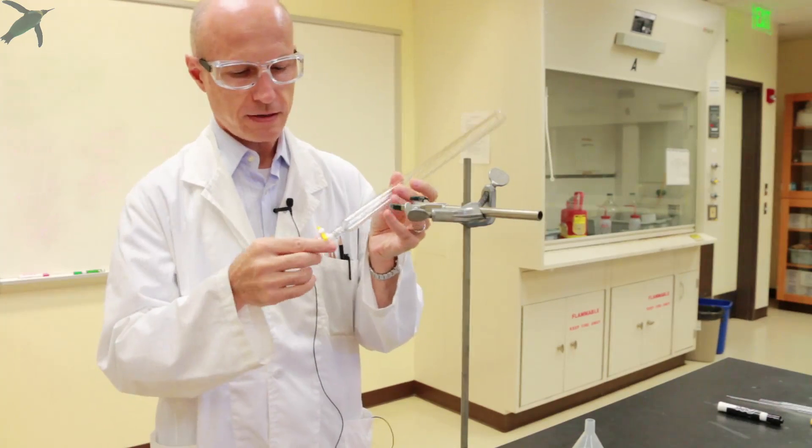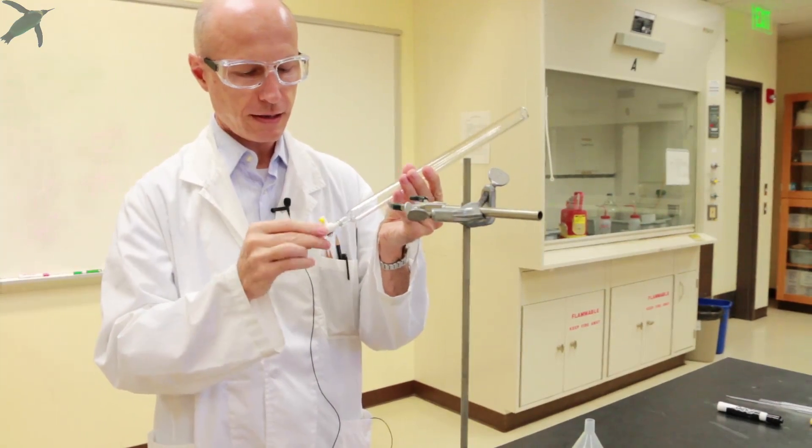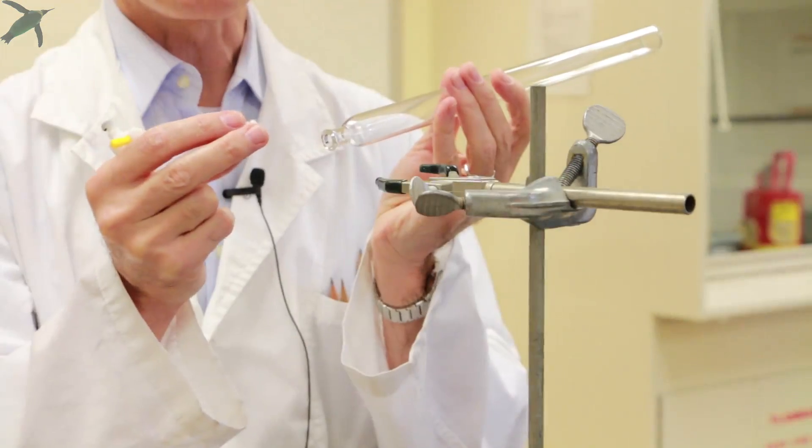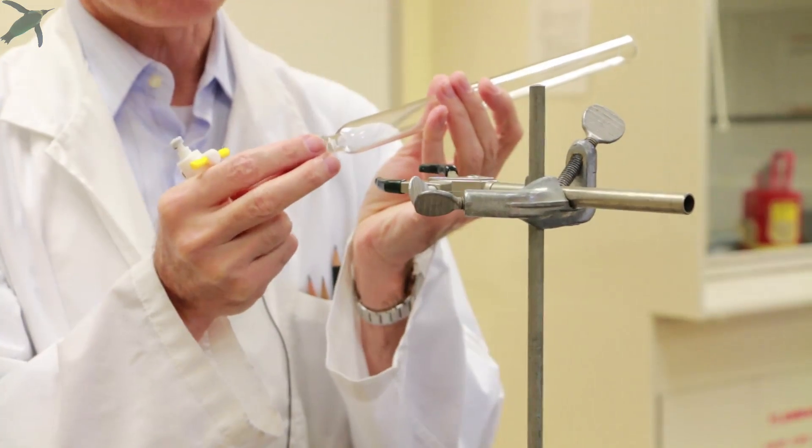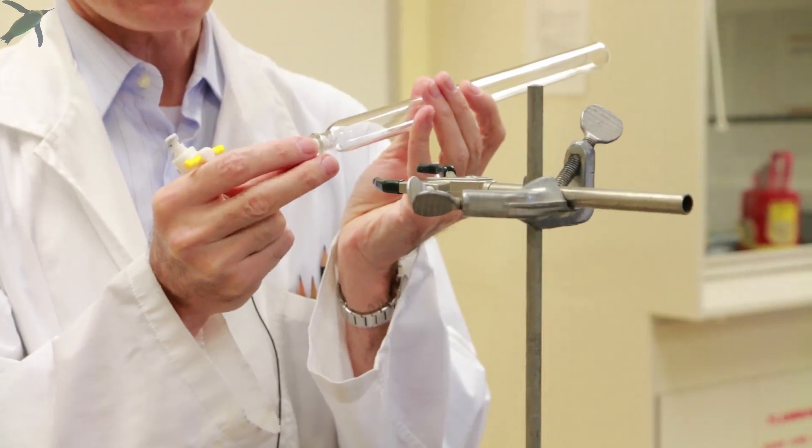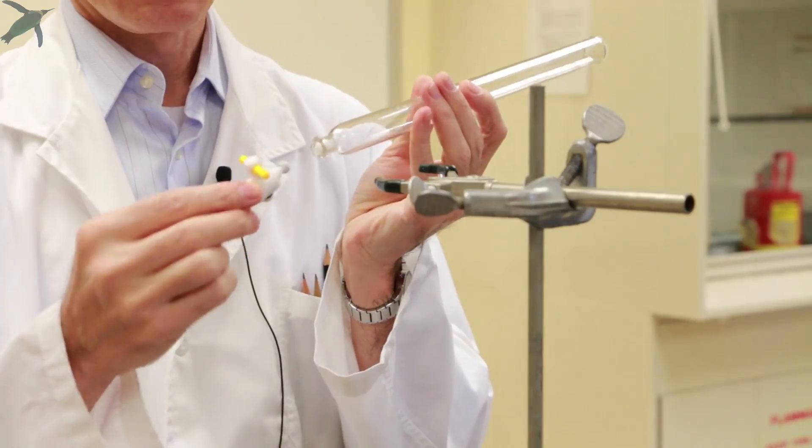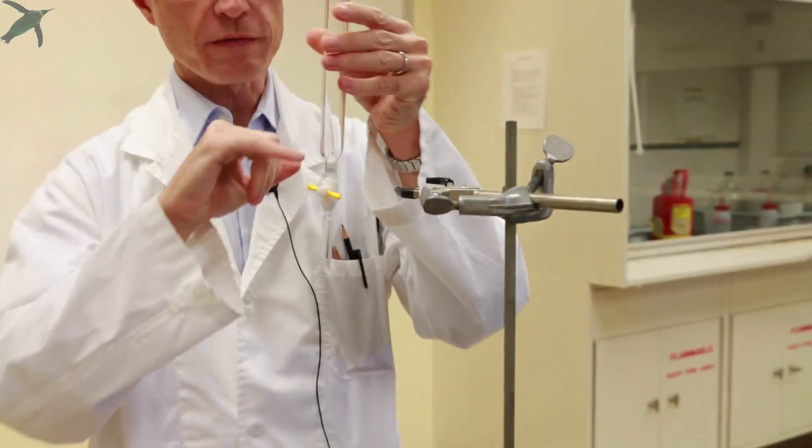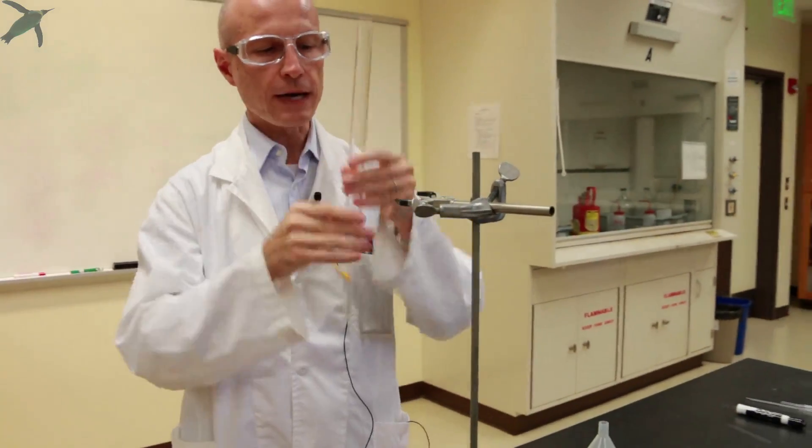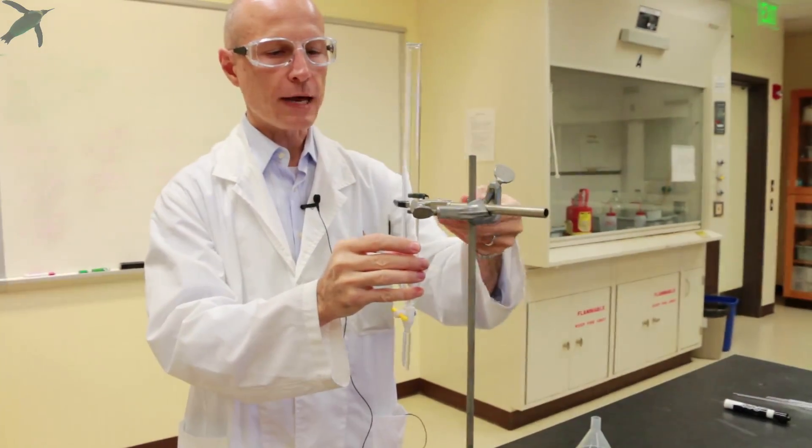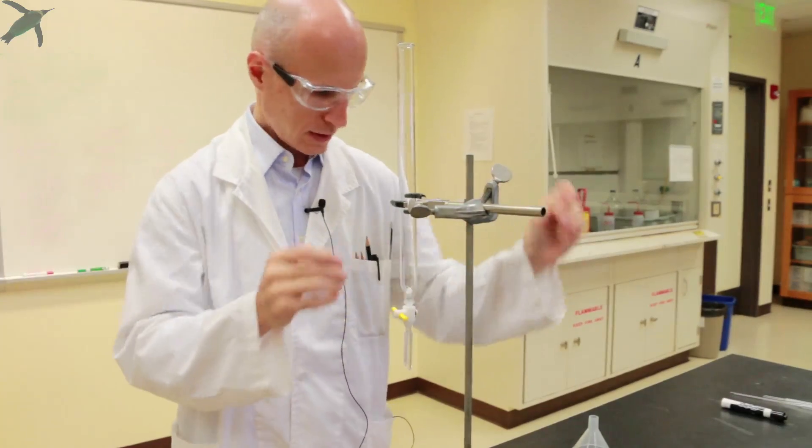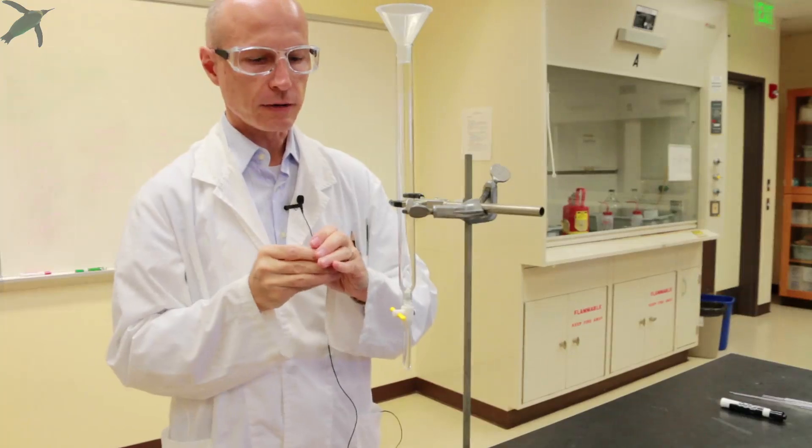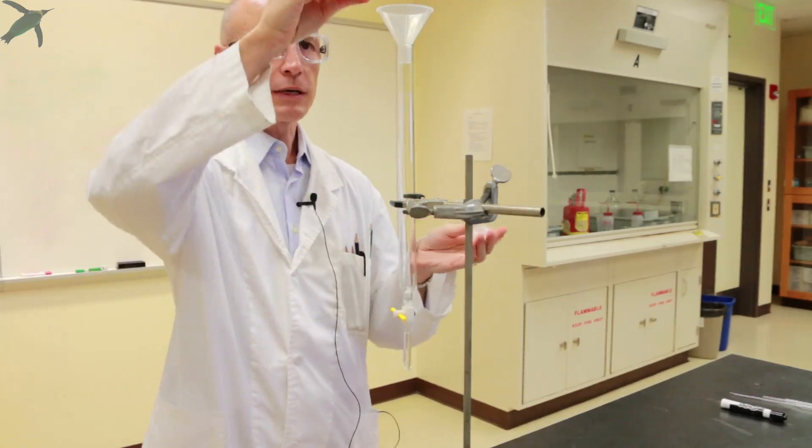The columns we have here are actually very handy because the stopcock comes out. The very first thing you want to do is take a very small cotton plug and put it at the bottom of the column, and then you carefully reinsert the stopcock. This will prevent the sand from going down the stopcock, and then you want to clamp the column. You put a powder funnel on top and you put in sand.